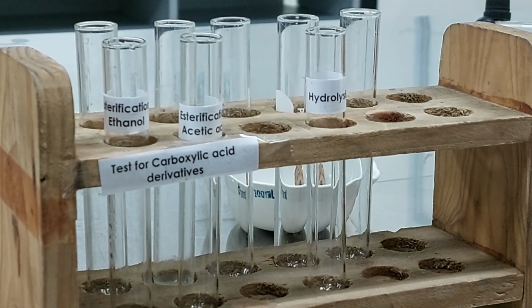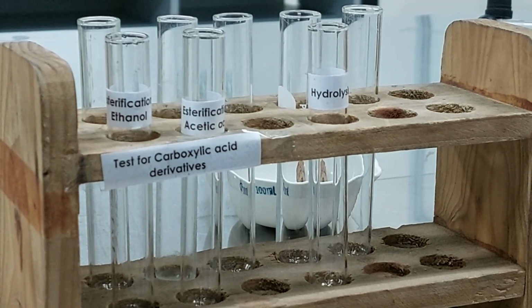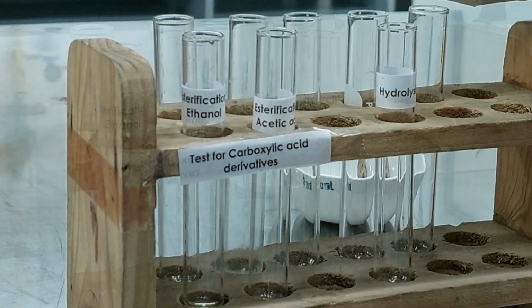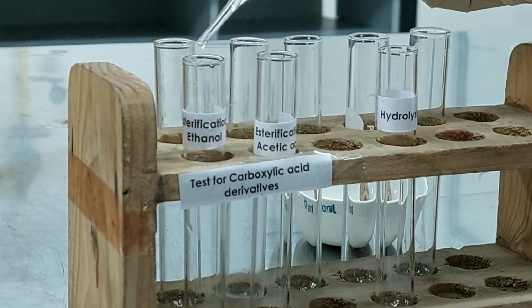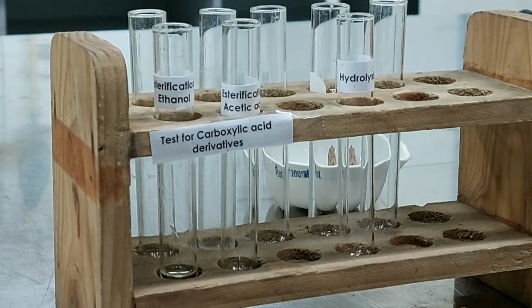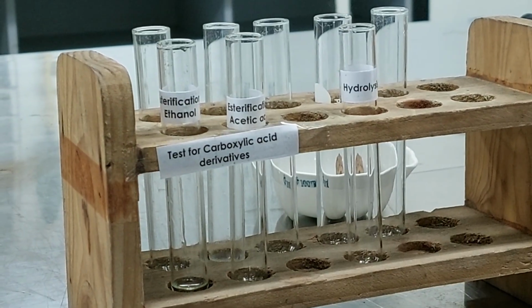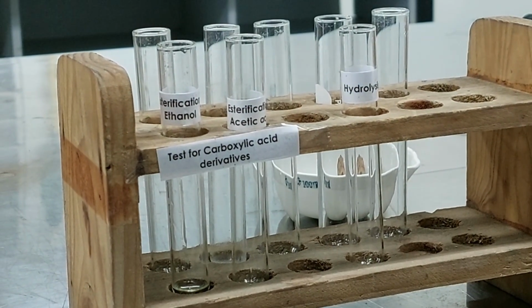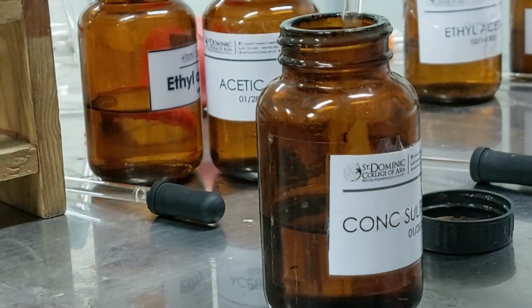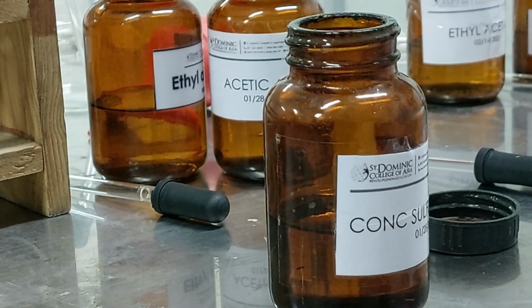You know acetic acid, just like vinegar, has a very strong smell. 1, 2, 3, 4, 5, 6, 7, 8. And then we're going to add 3 drops of the catalyst, sulfuric acid, concentrated.